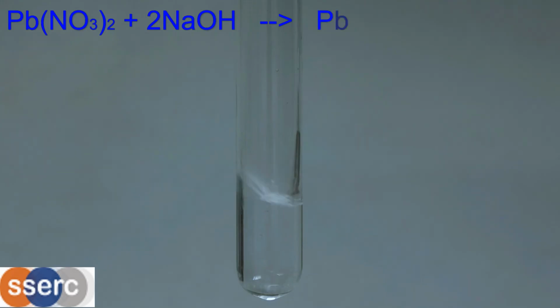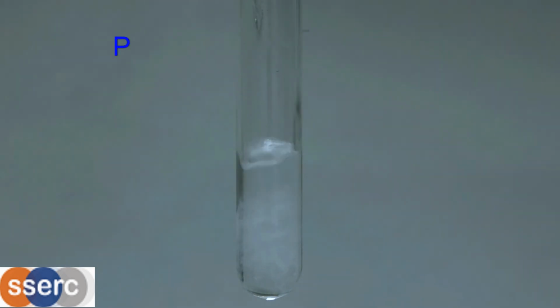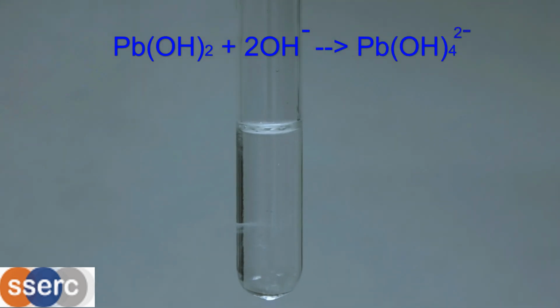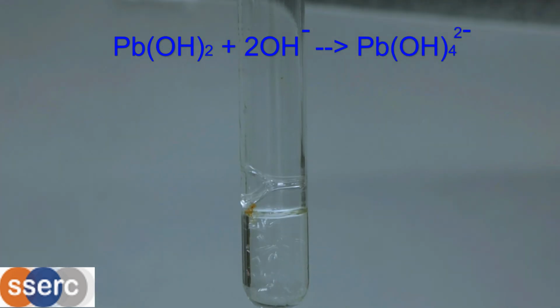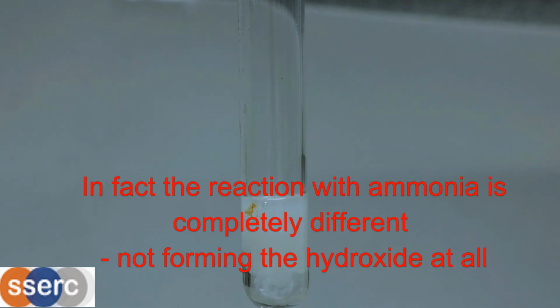Solutions of lead compounds behave in the same way as aluminium. With sodium hydroxide you get a white precipitate that dissolves in excess. Lead hydroxide is amphoteric, and with ammonia you get the same white precipitate, but it does not dissolve.